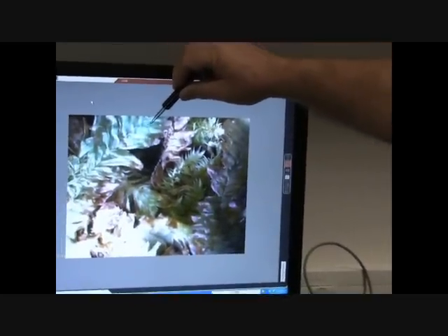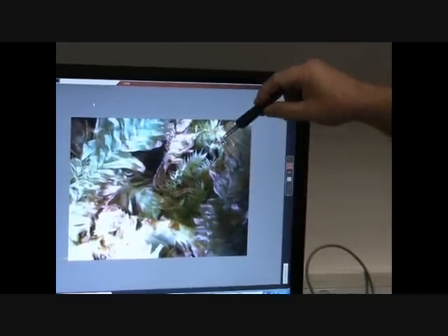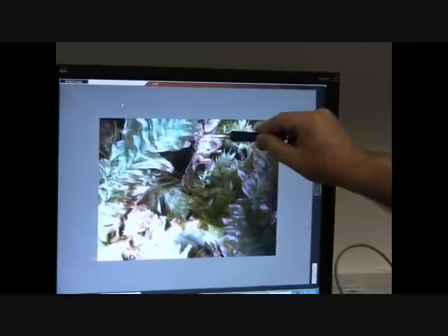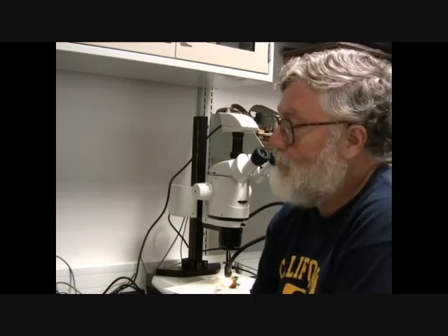We have this very large moss, we have this slightly smaller moss right here, we have a little liverwort mixed in right here, and we have another little liverwort growing up this moss. One of the issues is that plants often grow on top of other plants as their substrate. This was growing on a tree fern, so these plants were growing first on a tree fern, and then the smaller plants are growing on them. So there are several orders of epiphytism, which means growing on plants. Our job here is to try to separate these all out into separate packets and separate tubes for sequencing.